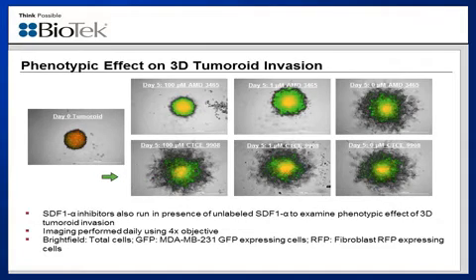By the images that were captured of the tumoroid structures in the presence of AMD 3465, it's plain to see that the compound is exhibiting dose-dependent inhibition of tumor invasion, whereas CTCE 9908, whose residence time value was shorter than that of the ligand, exhibits no discernible inhibitory effect on invasion at any of the concentrations that were tested.